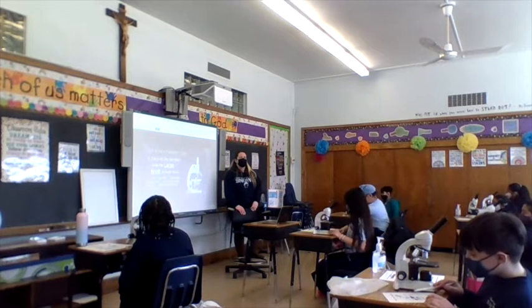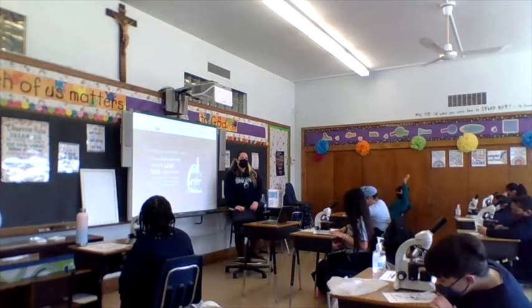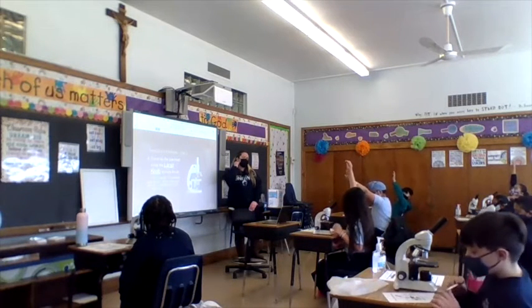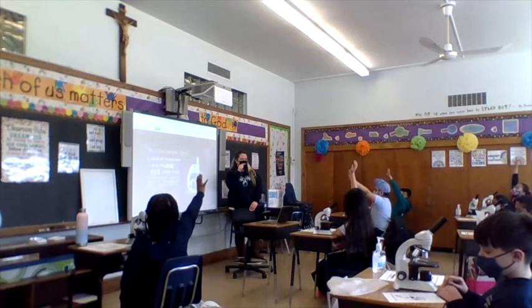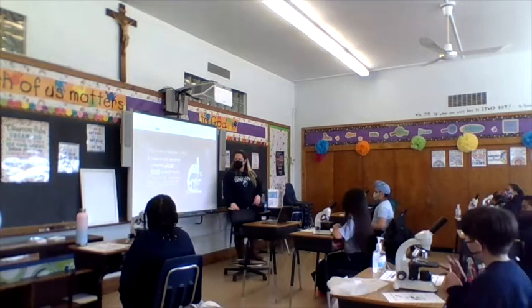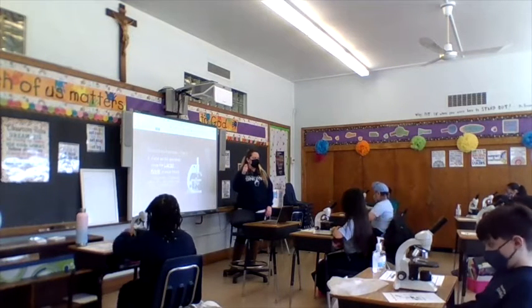Ziomara? The fine focus? The fine focus is the smaller one. There's another one. It finally makes it clear. Cassidy? Yes, say coarse focus. Good. So first, find your coarse focus. It's the larger knob.